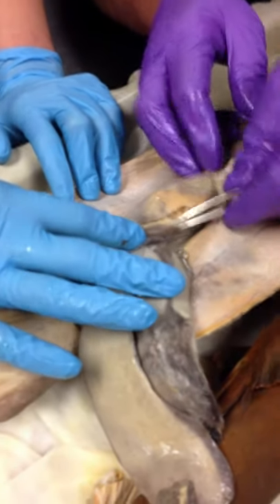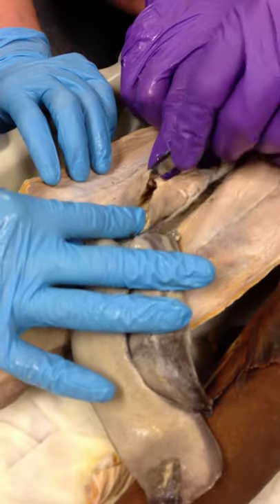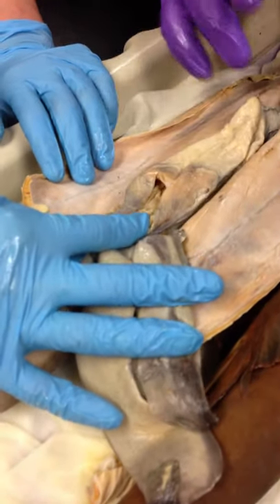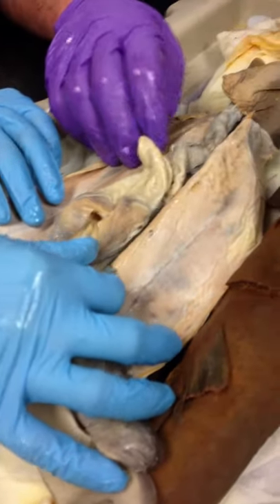Called rugae. You can see some wrinkles here and there. Yeah, we have them too. There's some wrinkles. And the rugae increase surface area. They allow the stomach to stretch so this animal can eat big things.